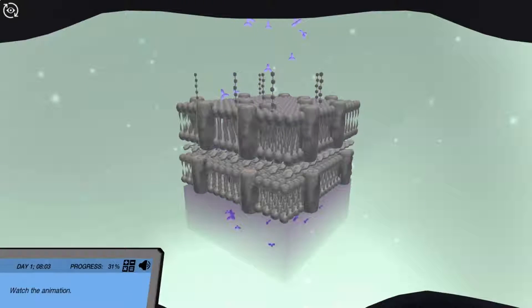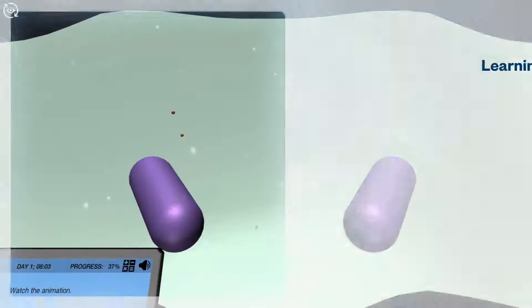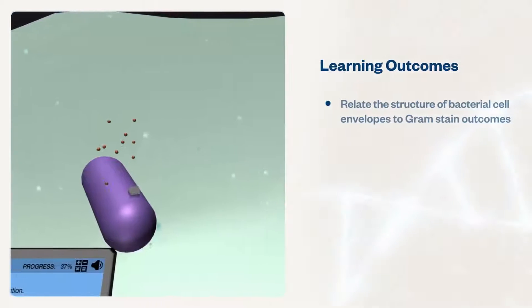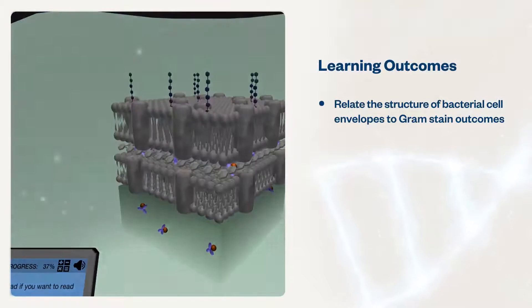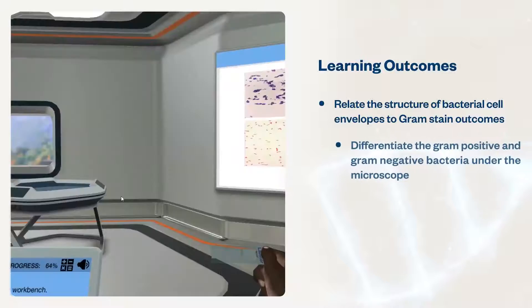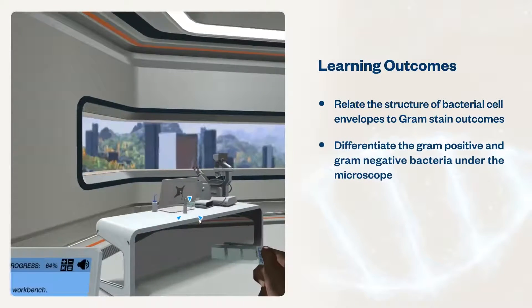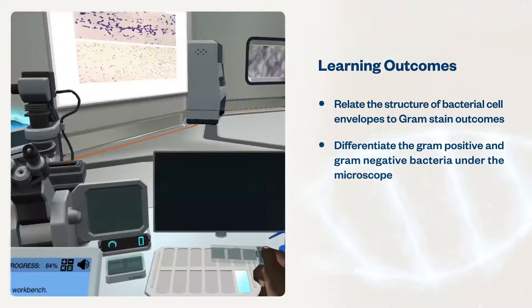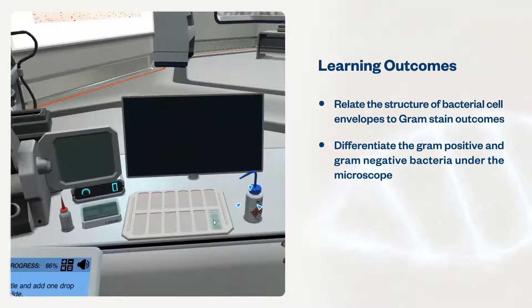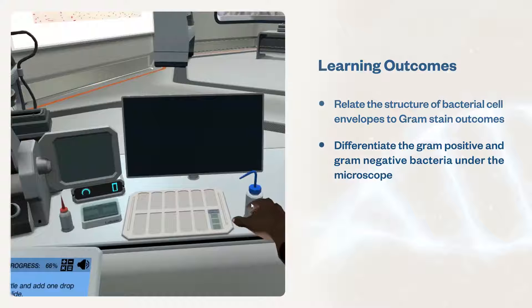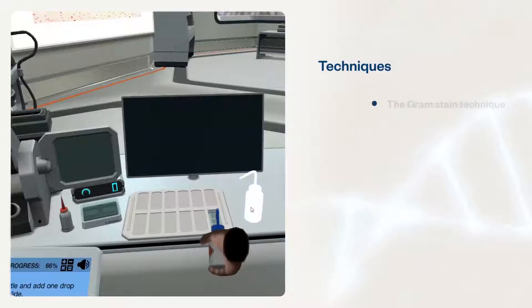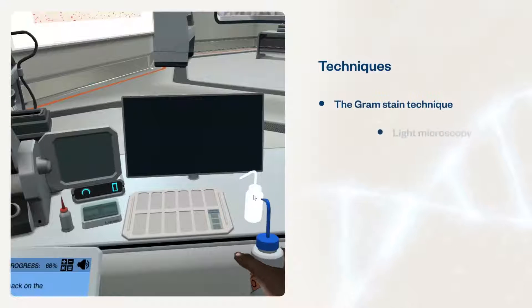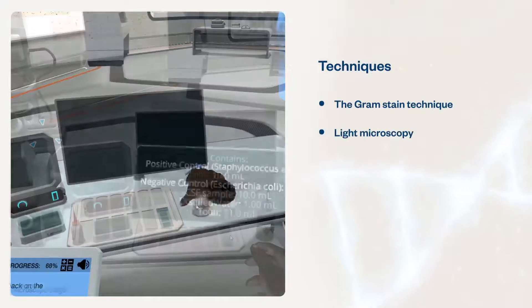These simulations will help students relate the structure of bacterial cell envelopes to Gram stain outcomes, differentiate gram-positive and gram-negative bacteria under the microscope. Students will use techniques such as the Gram stain technique and light microscopy.